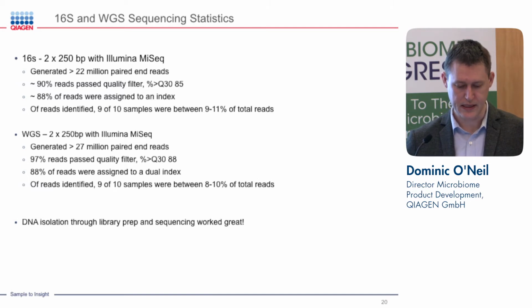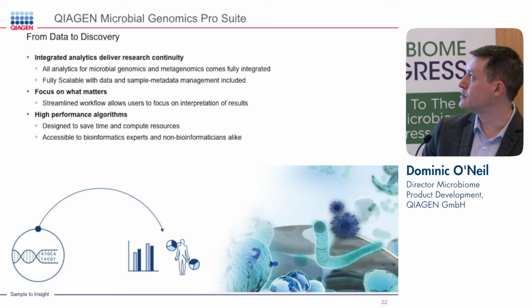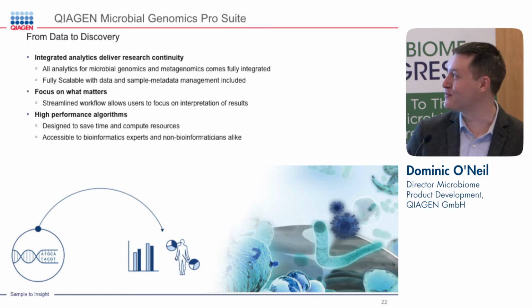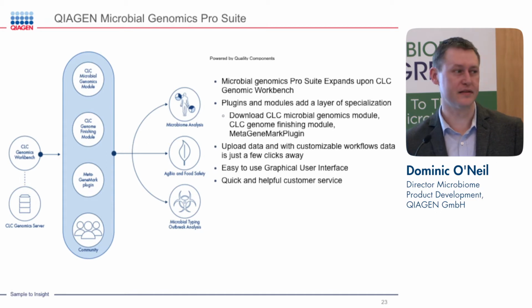And then we took the data coming off of the MiSeq and plugged it into the CLC Microbial Genomics Pro Suite to do our data analysis. I'm not going to talk about this too much since we have two other talks which will be able to talk about the Pro Suite in far more detail than I'm able to. But for us, as end users of the program, what was important was that it was a very easy plug-in into the genomics workbench.